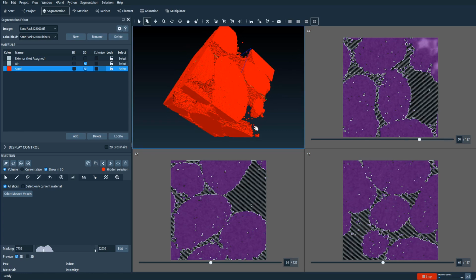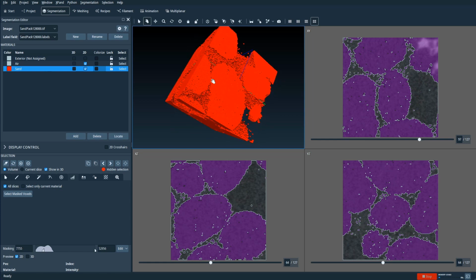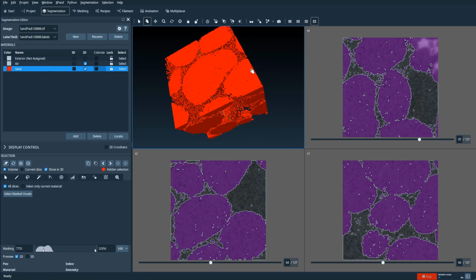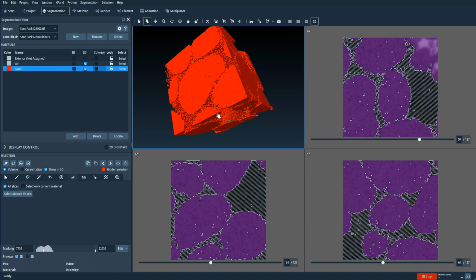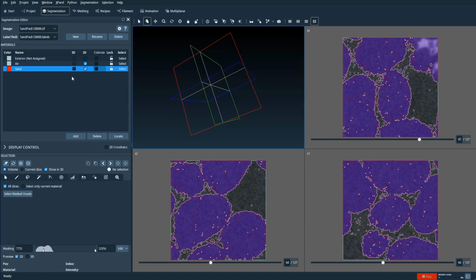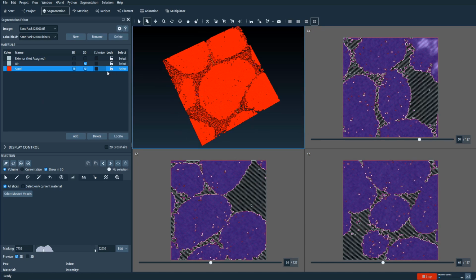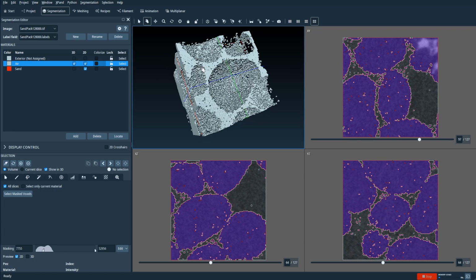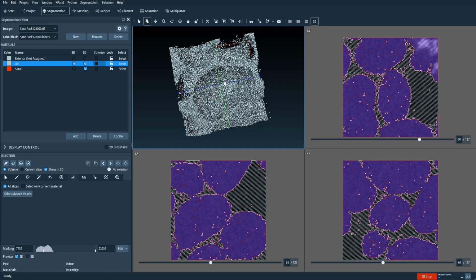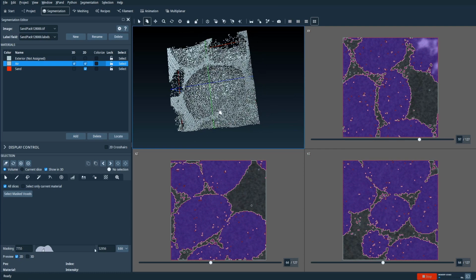And just like before, you can see these small selections here that we don't really want to have there. And it's just caused by having noise in our data. Okay, and for now, let's just add the selection here. Okay, so we now have our sand material and our air material, but with the noise in the selection, as I've mentioned before.